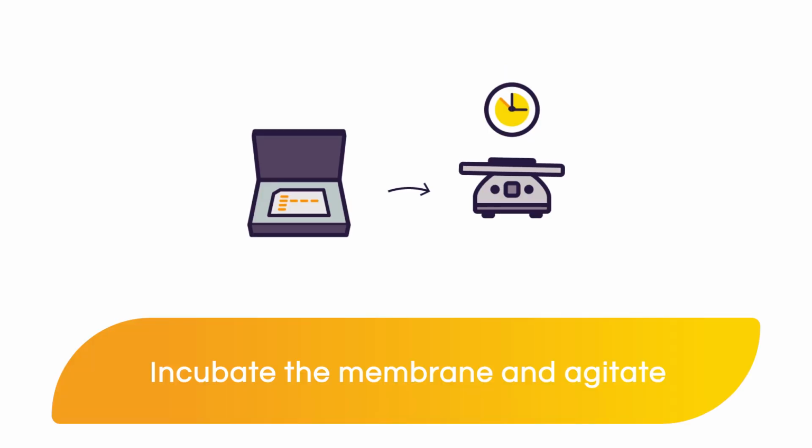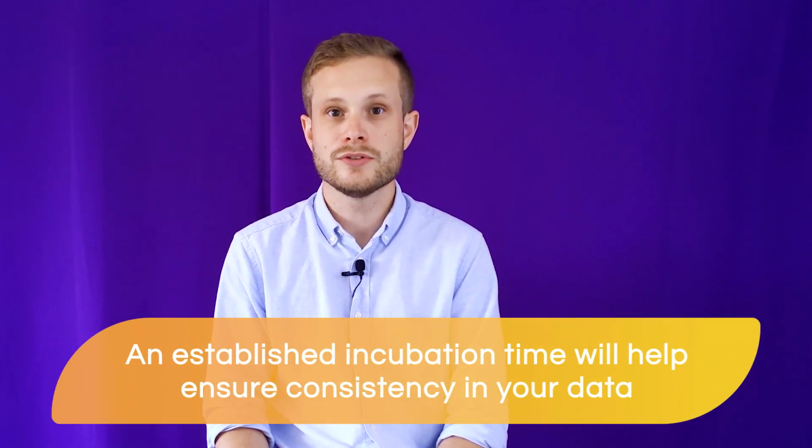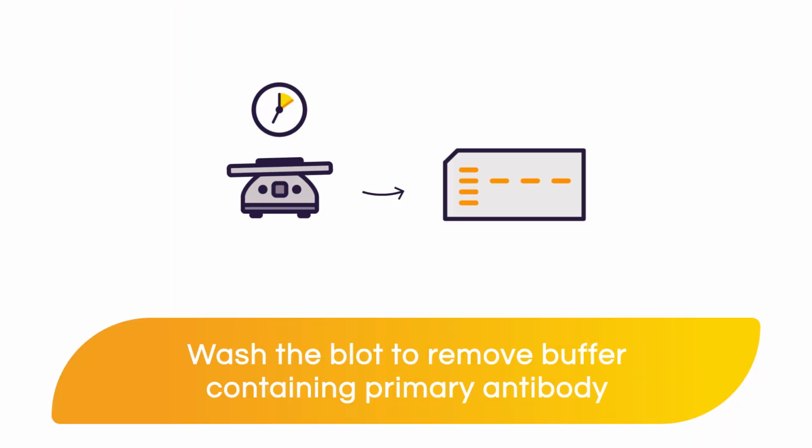Once the primary antibody solution has been prepared, it can be used to incubate the membrane with gentle agitation for about 1 to 4 hours at room temperature, or overnight at 4 degrees Celsius. Once you've established your incubation time, you should stick to it for all future blots to ensure consistency in your data. Once the incubation is done, the next step is to wash the blot to remove any unbound antibody.